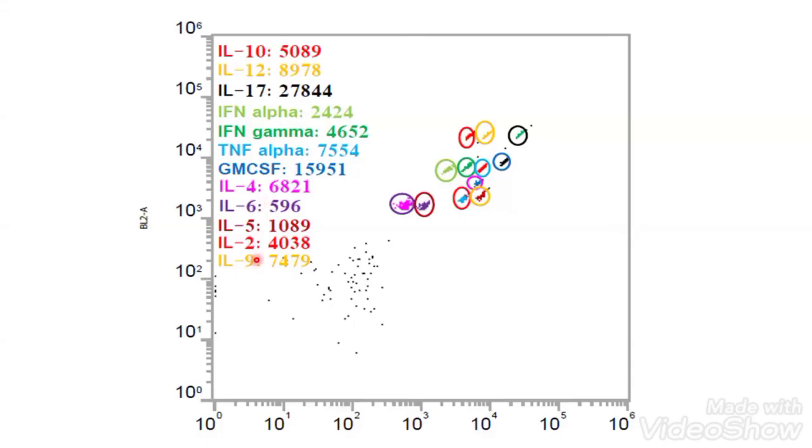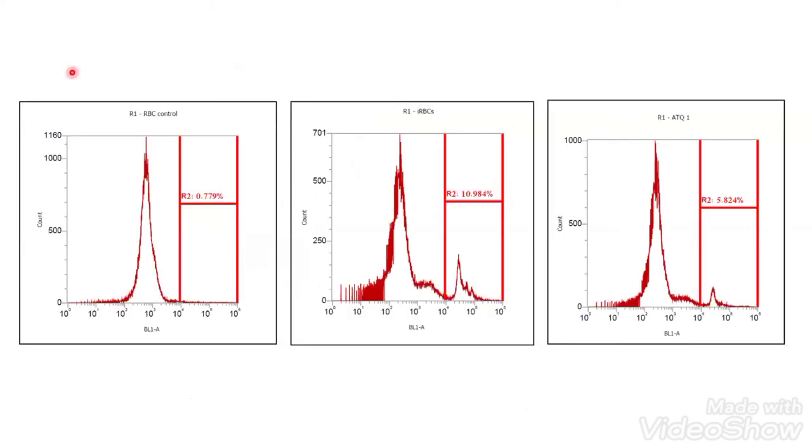anti-inflammatory molecules. Simultaneously, 12 to 18 molecules we can analyze in one sample. That is equivalent to 18 ELISA. So 18 ELISA reactions per sample you can do in one day multiplied with 7,200. So that saves your time as well as your cost. So even mRNA analysis, cytokine analysis, antigen analysis, nowadays are shifting towards what? Cytometry. So now I will discuss the last application which I did in my lab, and I'm very happy about it. It is one of my favorite applications.